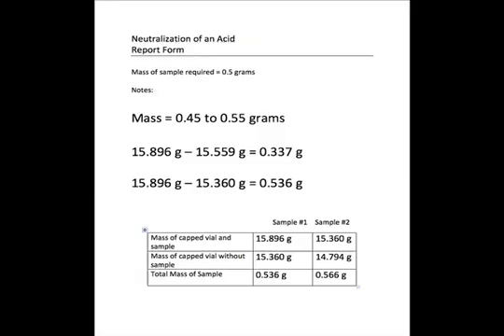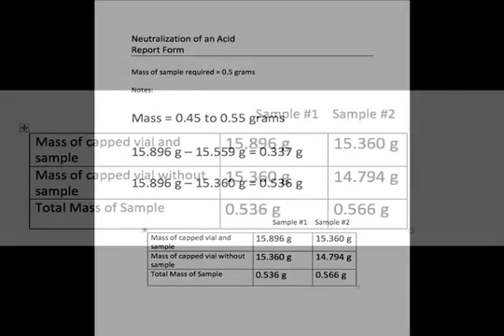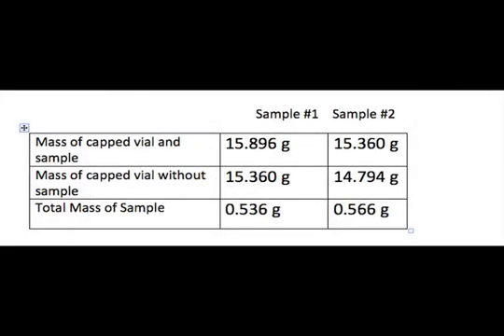To determine the mass of sample in the number two beaker, we subtract this amount from our previous mass. 15.360 minus 14.794 grams equals 0.566 grams, close enough to our needed sample size.